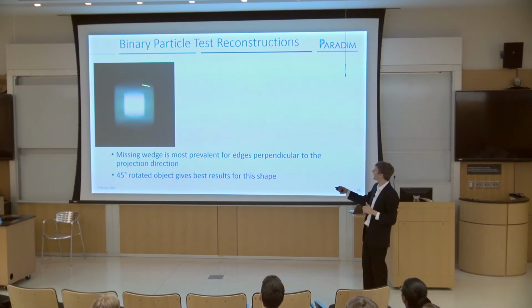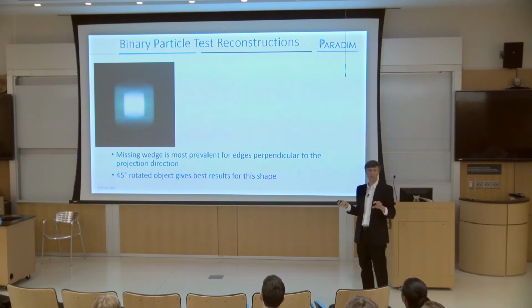So if you didn't really know where in space your original projection direction was, or where the missing wedge was, you might not be able to make a measurement or figure out what this object really looked like, right? And this is with, I think, plus or minus 70 degrees. So we're missing this information really, really badly. This is the information we're really missing, OK?